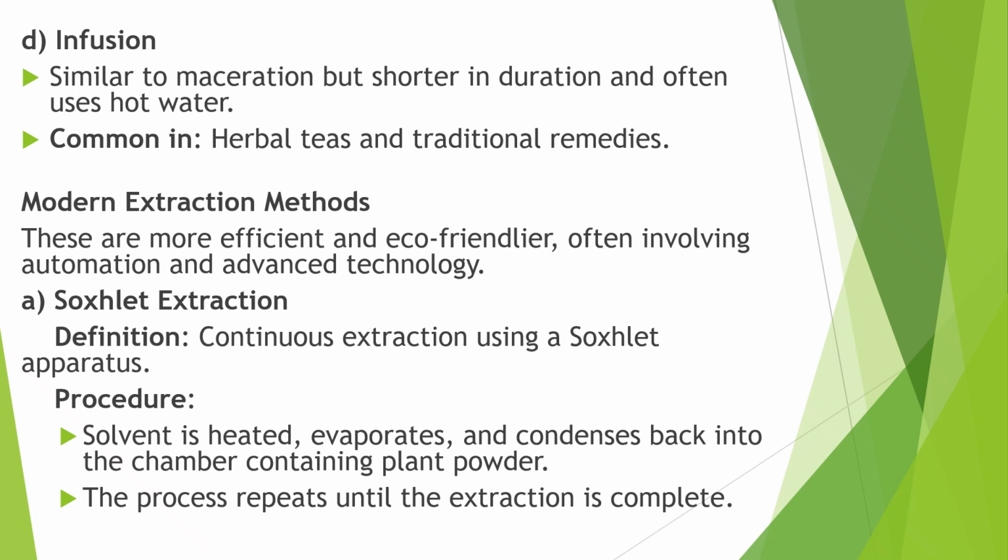So as far as the infusion is concerned, in broad spectrum, infusion can be implemented in two different ways. One is cold infusion, another one is hot infusion. In cold infusion, you have to add the solvent along with the drug and keep it for a specific time period, probably from 24 hours to 48 hours, maybe extend up to 72 hours max to max. And in such case, with occasional stirring, of course.